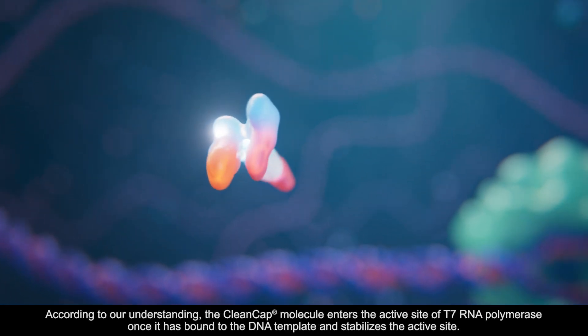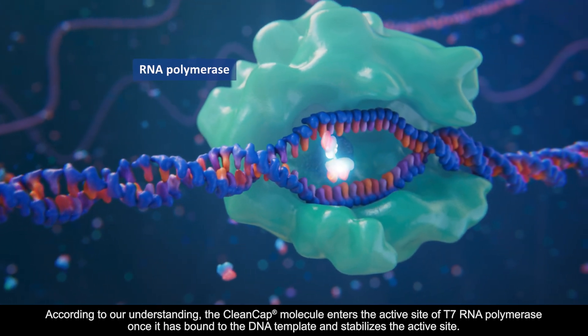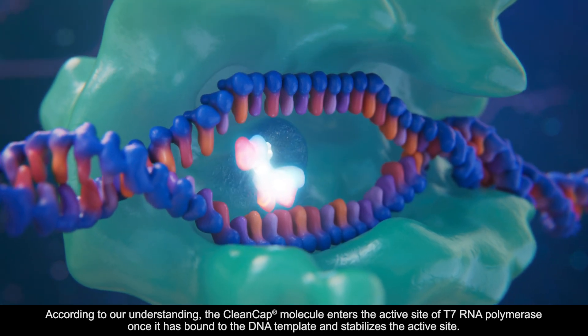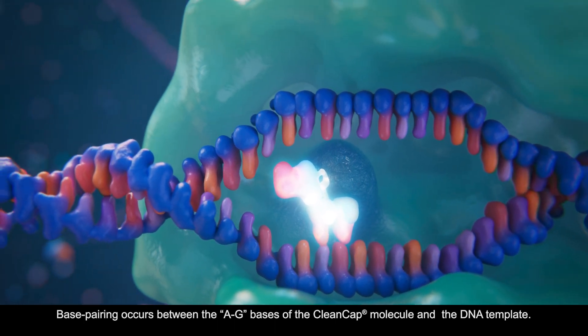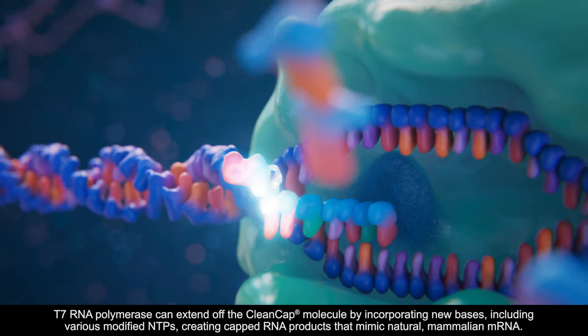According to our understanding, the CleanCap molecule enters the active site of T7 RNA polymerase once it is bound to the DNA template, and stabilizes the active site.